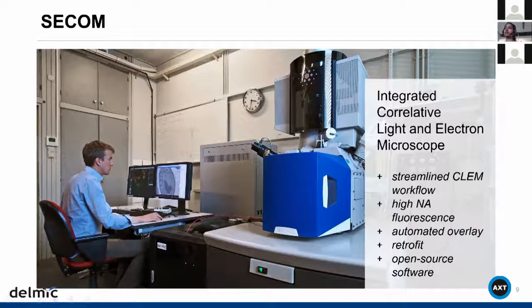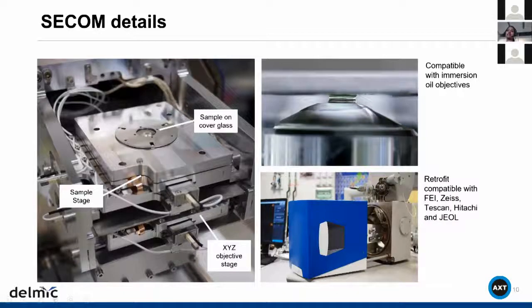But let's take a look at how the SECOM itself looks on the inside. In the large image on the left, the annular metal disc that I'm showing here is the sample holder. The sample is placed on the cover glass. If there is an ITO slide with glass on it, it can be glued onto this in a stable way.